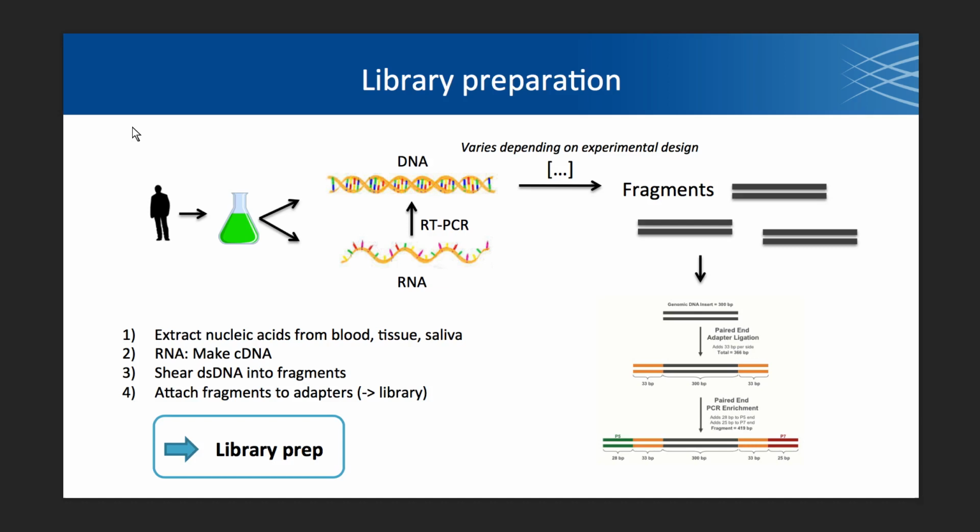right? They're made out of DNA, but they fit the sequencer in a way that enables us to sequence them. And so these adapters, we add them at the end of the fragment, and that enables us to put this on the sequencer. It sticks to the sequencer, and then we can read it through. It also has these primers that help us begin the process of sequencing.